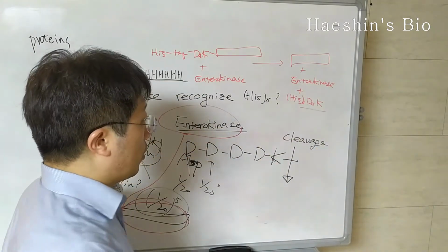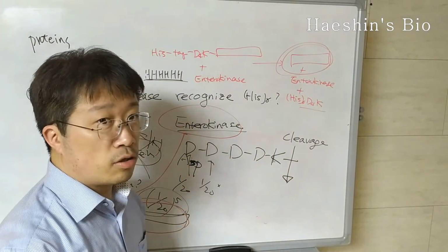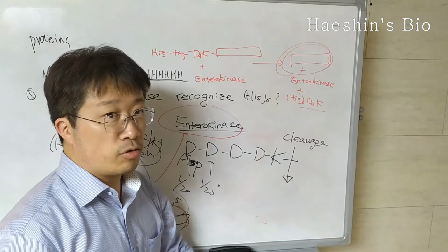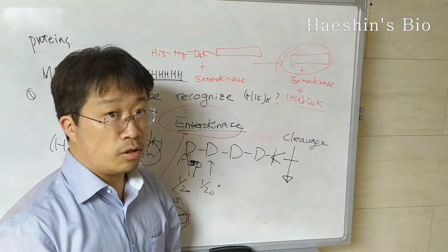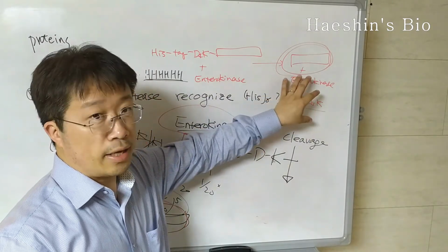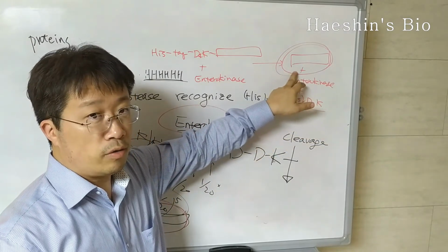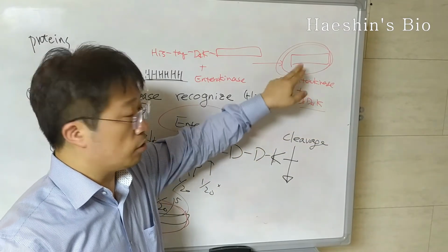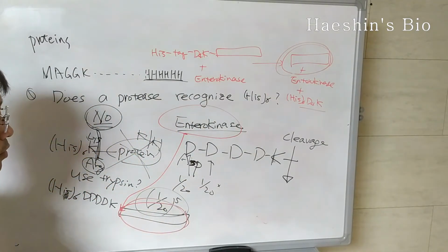So anyway, you have to purify it again. So you have to purify this one. So you need another chromatography. You cannot use the regular NTA nickel affinity reagents in this case, because the histidine tag is now gone. So you have to use probably gel filtration chromatography, which is size exclusion chromatography, because they are probably different sizes. So that is another chromatography required.